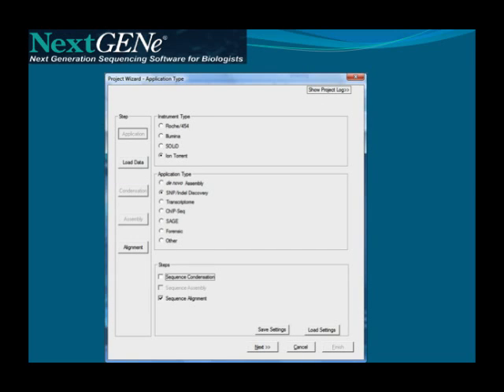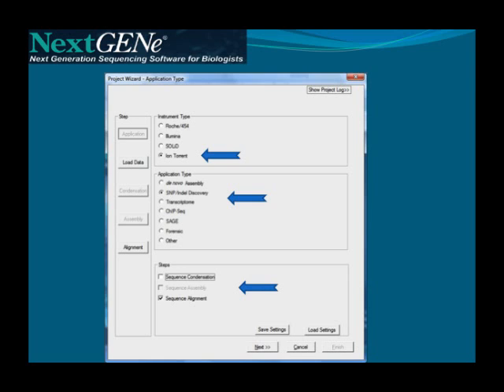Setting up the analysis of your IonTorrent data with NextGene is simple and straightforward. First, select IonTorrent under Instrument Type. Second, select your application — SNP and indel discovery, for example. Finally, choose which analysis steps are to be used. Sequence condensation is an optional step, which can be used to reduce sequencing errors.